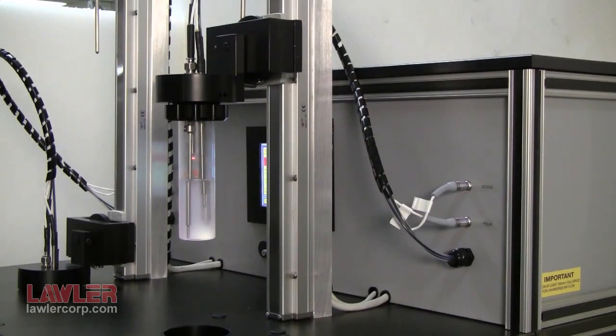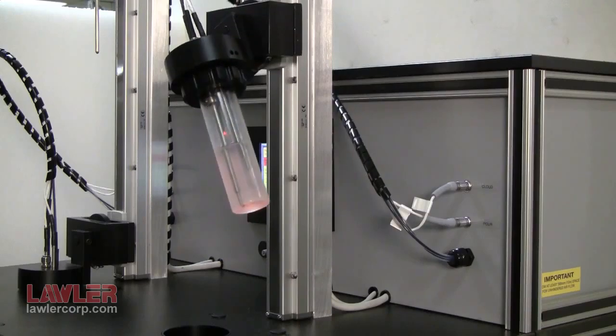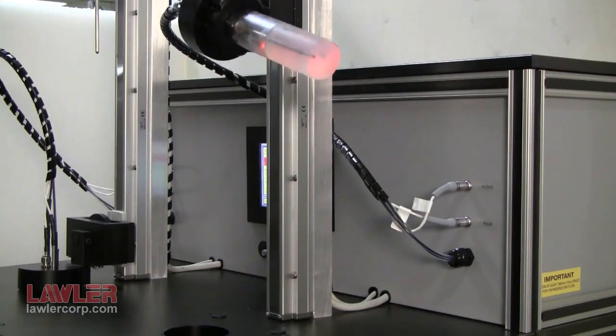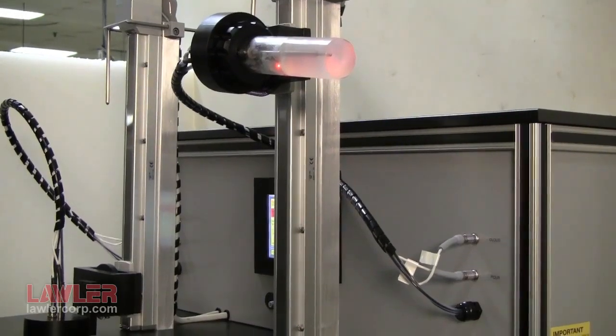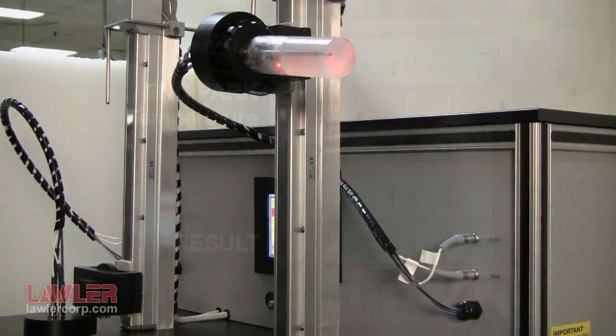This sample shows no movement, ending the test. Lawler DR4s use a non-contact sensor for pour point detection, so the sample is not touched.